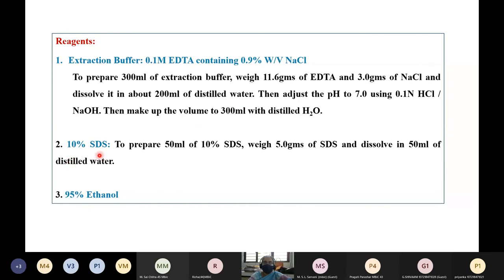The next reagent is 10% SDS. To prepare 50 ml of 10% SDS, weigh 5 grams of SDS and dissolve in 50 ml of distilled water. You can also prepare 95% ethanol.